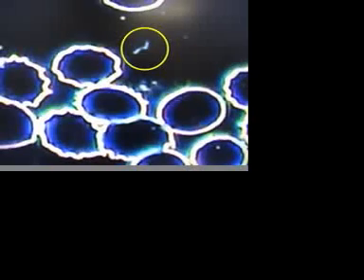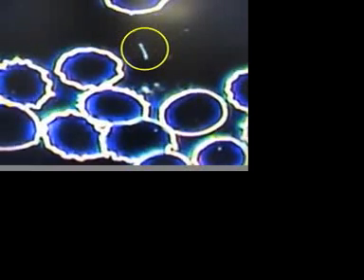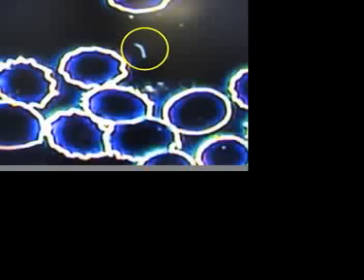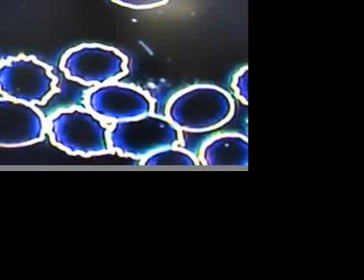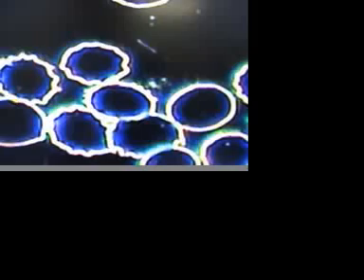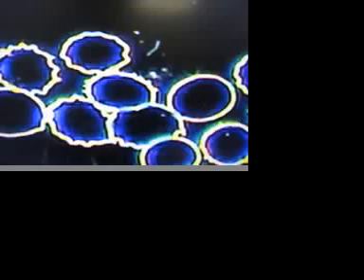This guy, hard to say, seems to have some of the properties of Organism X, seems to be moving. If it is, it's a small one. Hard to say if that means that it's younger than the others, but again, it does exhibit some of the properties. We'll give it a 50% probability of being Organism X, and about a 50% probability of just being a part of a cell wall.